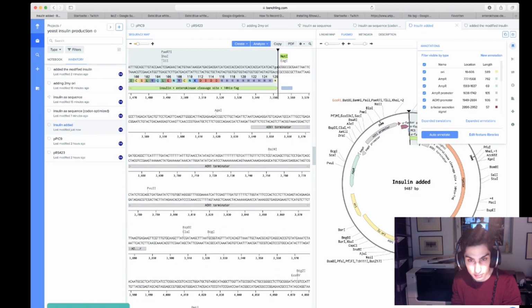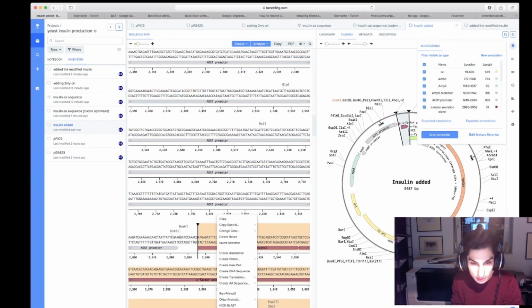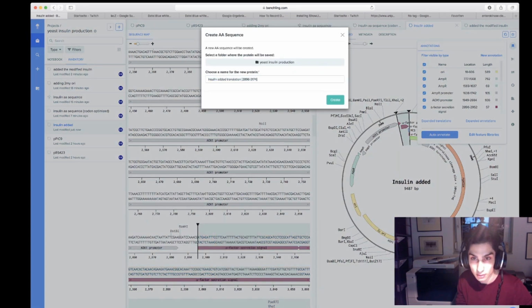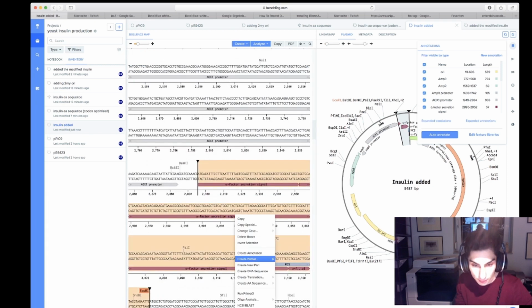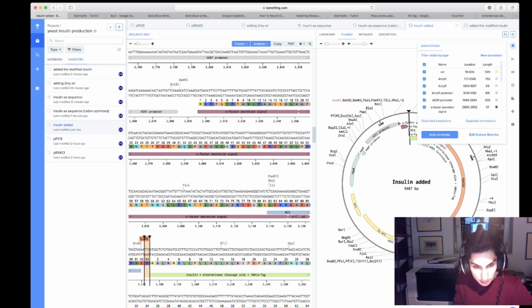Okay, a very descriptive annotation. And now I will add the translation of the alpha secretion factor too. Create. Oh, no. First, you can use the translation, right? Yeah. It all should be in line, work, right?